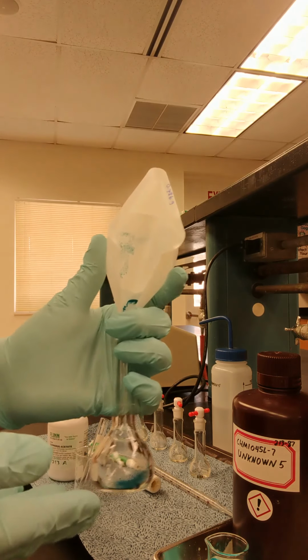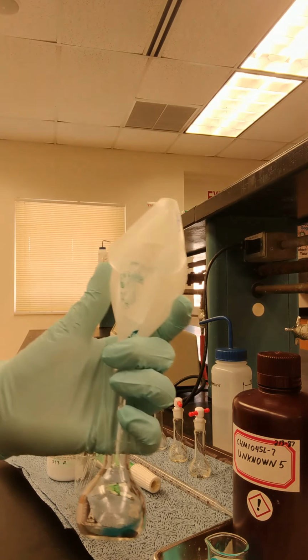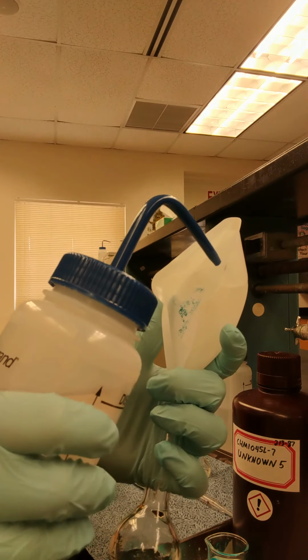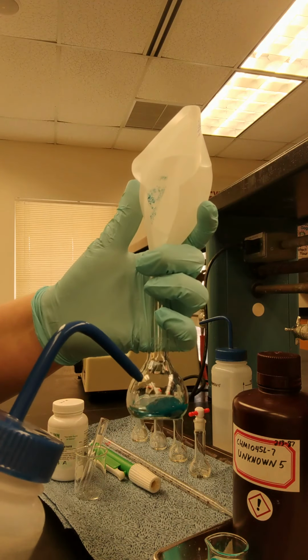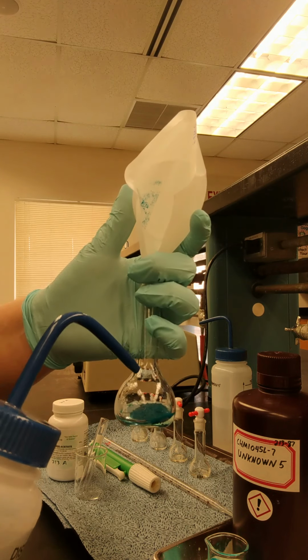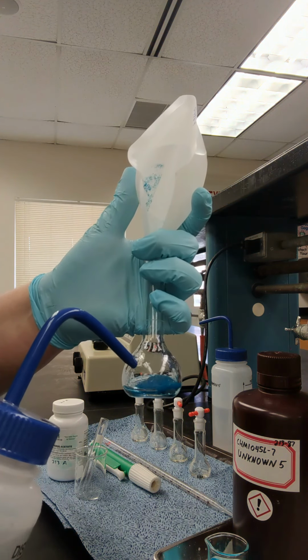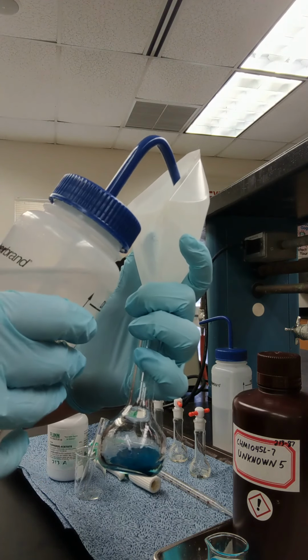Remember, this is the solution that we're going to determine the concentration of, and from this one, we're preparing all the other standards. So I'm rinsing with small amounts of water because you have a total volume here and you have to make sure that all of that solid is dissolved before completing that volume to the 25.